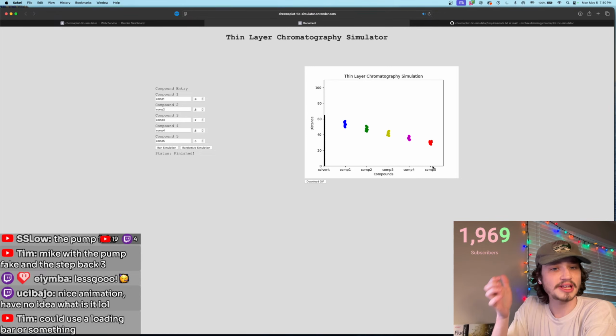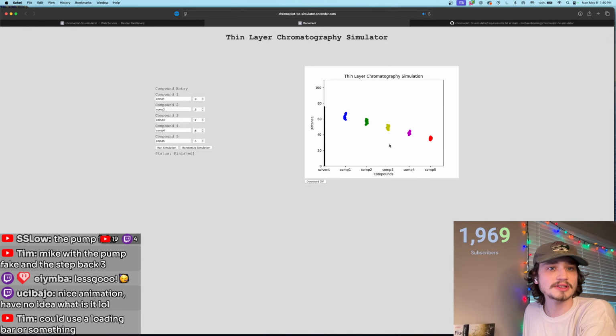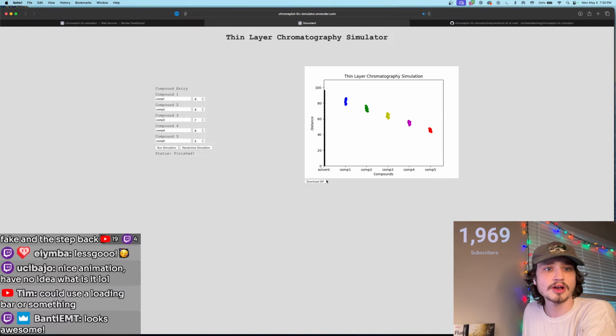Then you dip the paper in the solvent just below the x-axis line. The solvent creeps up through capillary forces and electromagnetic forces through the medium, the mobile phase, and drags up with it the compounds at various rates depending on the interactions with the solvent and the solid phase.